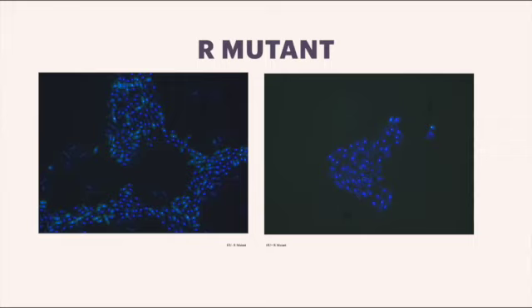In regards to the GFP production, there is much less in the HU plus side, which leads us to believe that it is a DNA repair mutant.